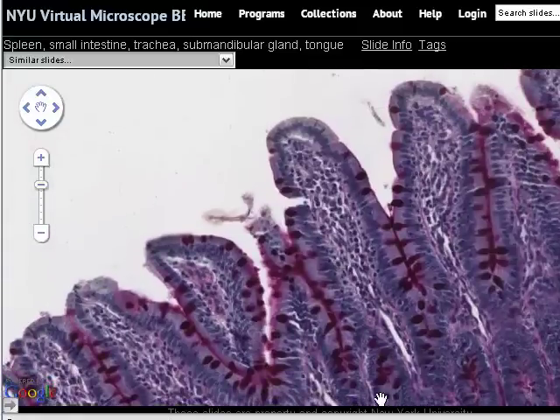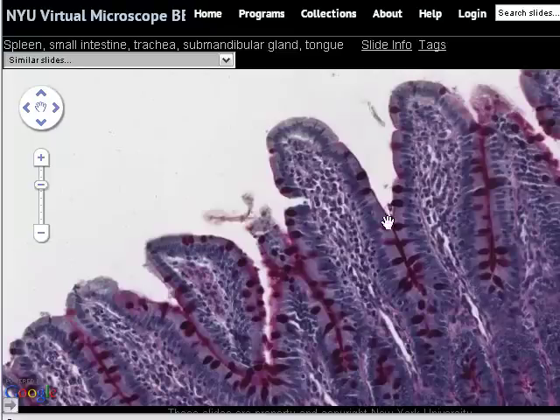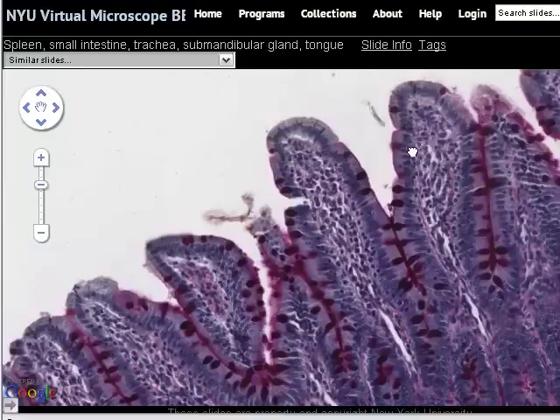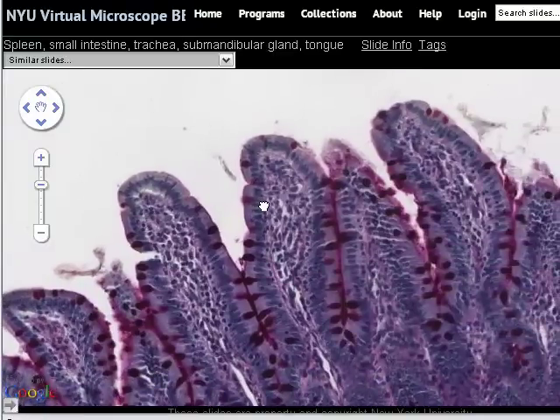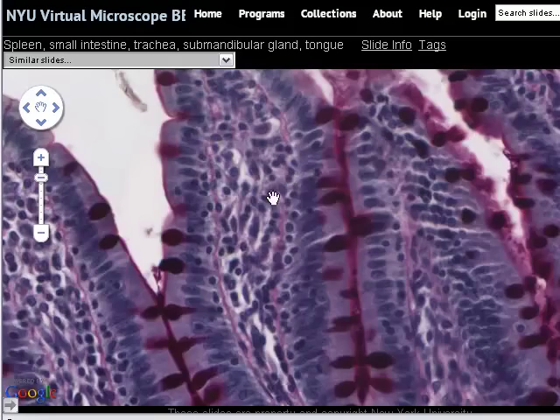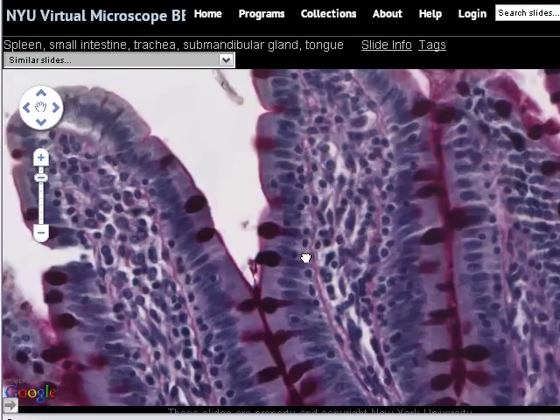Now we've zoomed in again. Here's one villus — here's the core of the villus, made up of loose connective tissue. It's very cellular; it's not really possible to see much of the fibers or the blood vessels in the core. Here we can see lining the surface of the villus, standing like soldiers on parade, are the simple columnar cells characteristic of the epithelium throughout the small intestine.